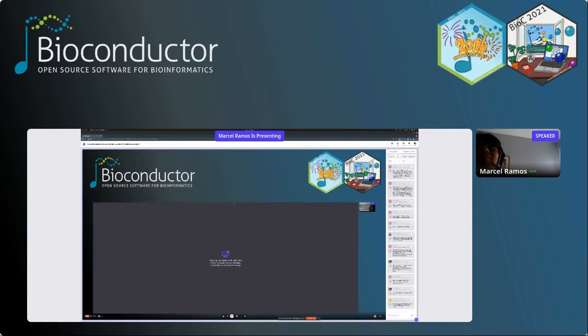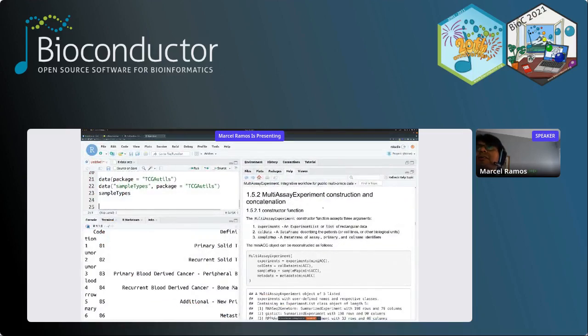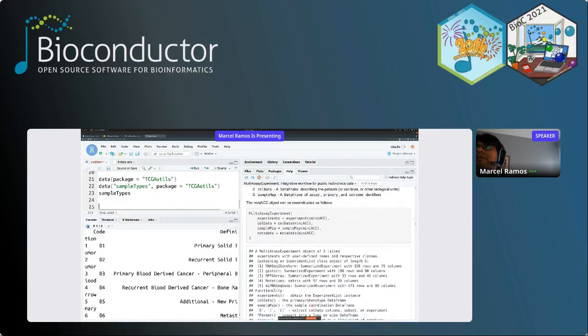Okay. Good questions. Let's continue with our workflow here.